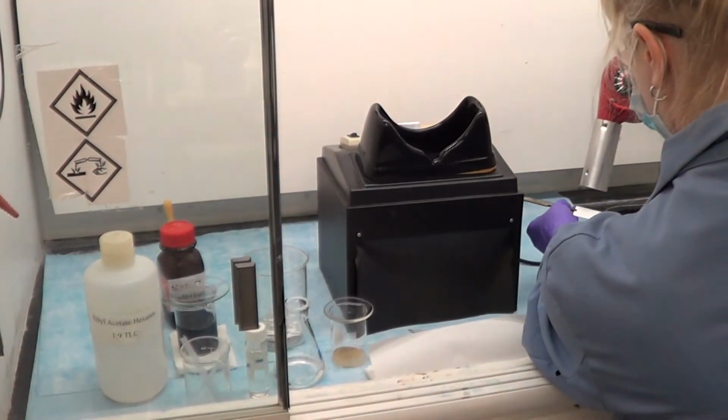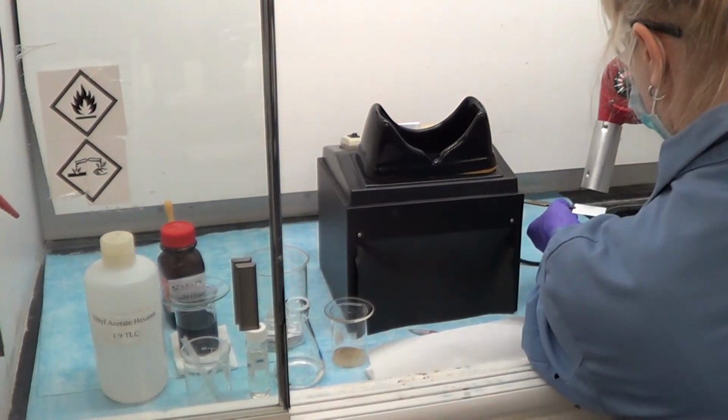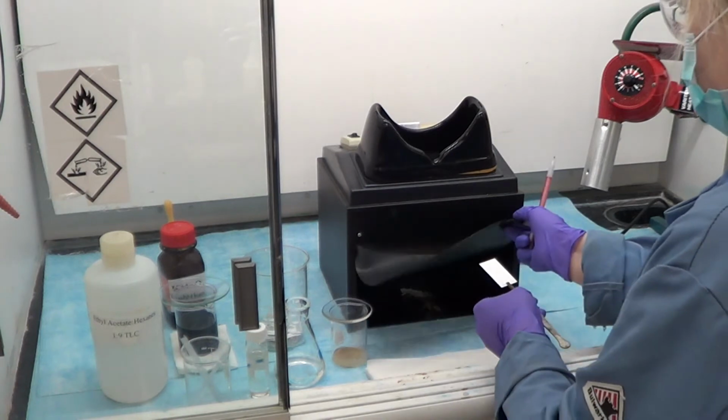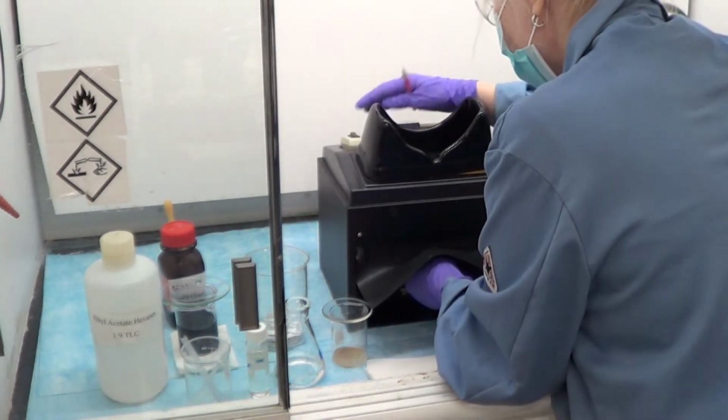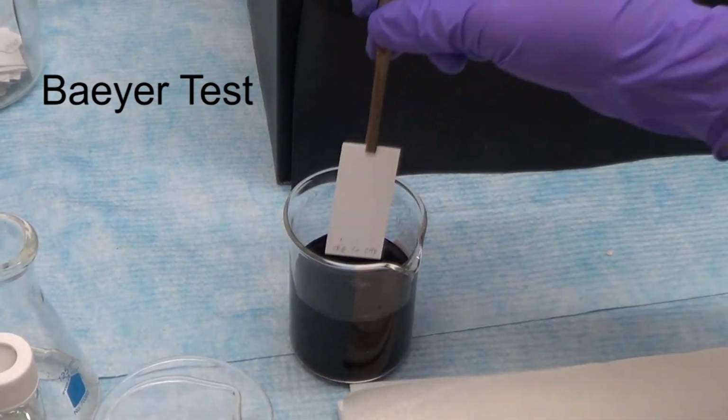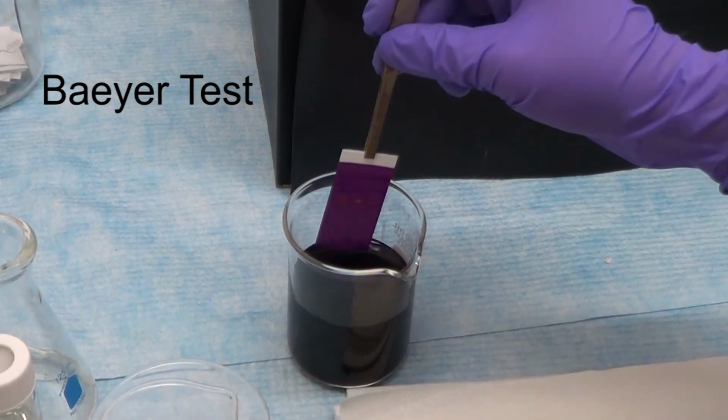The TLC plate is then dried to remove excess solvent and observed under UV-vis to see if there are any spots. The spots are then circled. You should be able to determine if the experiment was successful in extracting carvone. Also, based on the Rfs, be able to determine whether the enantiomers have similar polarities.